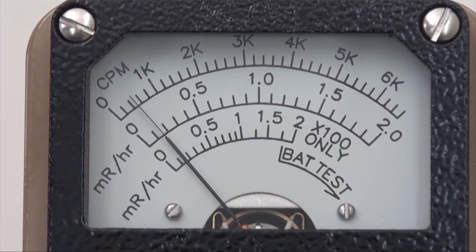In this example, we see the switch set to x10, and the needle pointing to 500 on the counts per minute scale. So the actual radiation reading is 5000 counts per minute.